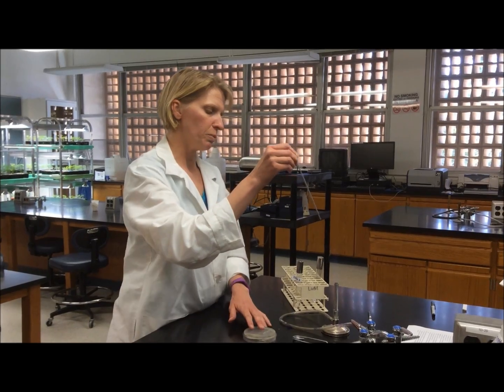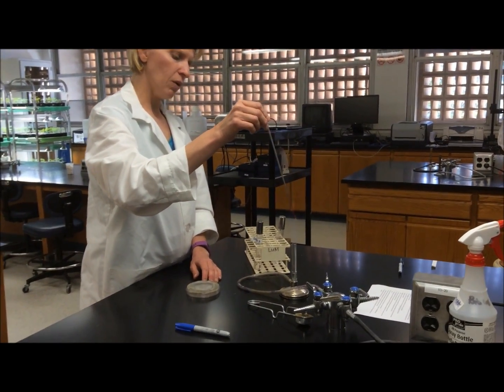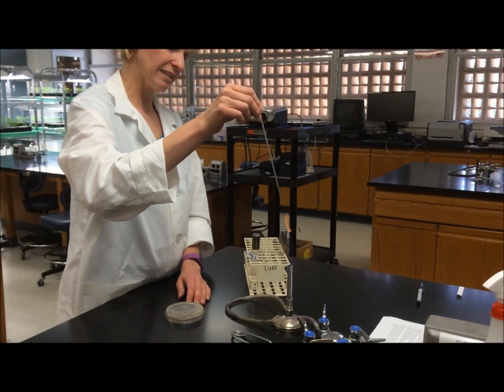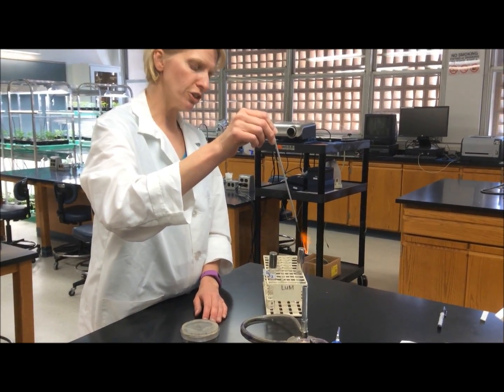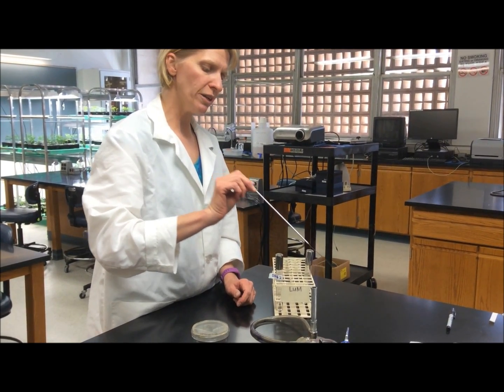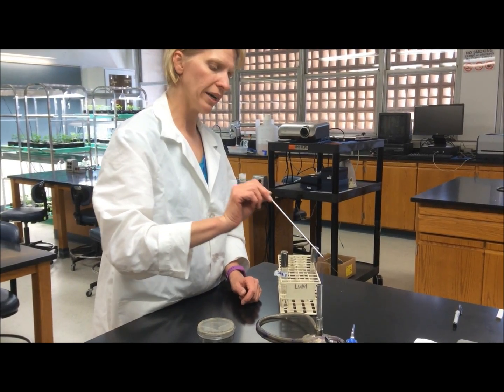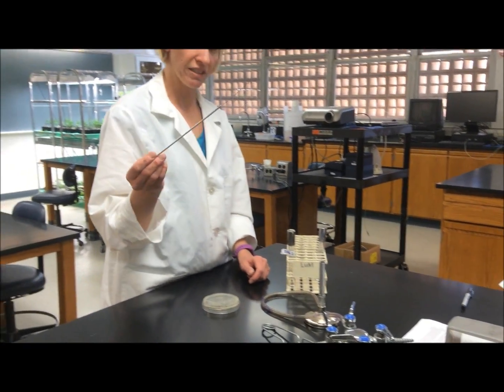To inoculate the liquid culture, you need to use a sterile inoculating loop. You can sterilize your inoculating loop by holding it in the flame at a slight angle until the wire becomes red hot. When working with liquid cultures, it's really easy to contaminate the neck of the tube with the inoculating loop, so it's very important to run the top part of the wire through the flame just to burn off any dust that might fall into the culture.